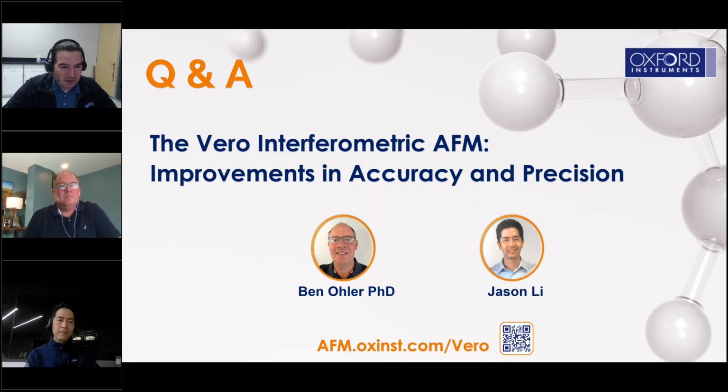Thank you. So another question here for Jason. How do you optimize the position of the blue drive and QPDI lasers on the cantilever? Yeah, and it's nice because with Vero we still have the option to have blue drive. With the previous interferometric AFM that we released, the IDS, that took the place of blue drive, so we didn't have that option. But you would optimize the blue drive spot just as you normally would. We typically put that on the base of the cantilever and move it around for the largest actuation amplitude.